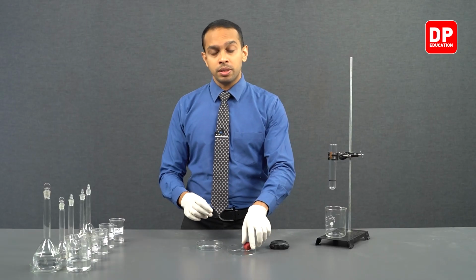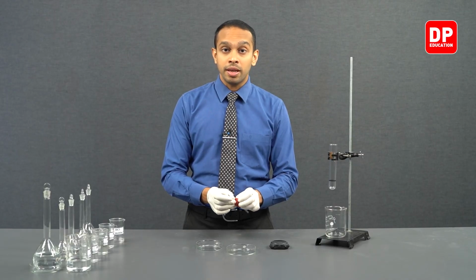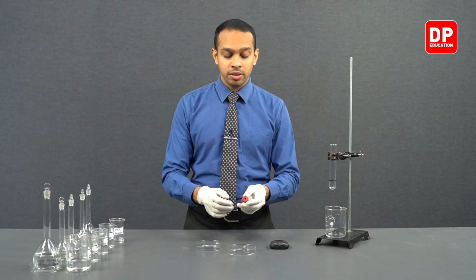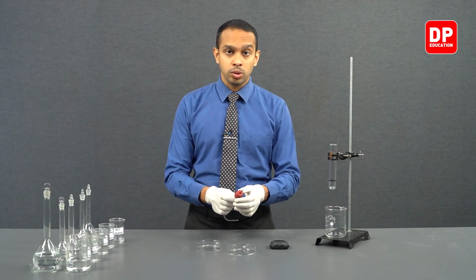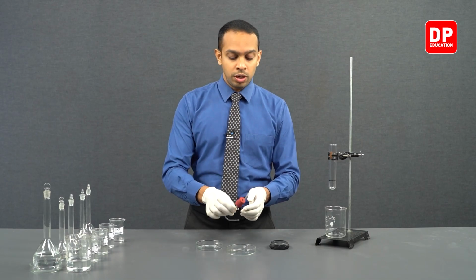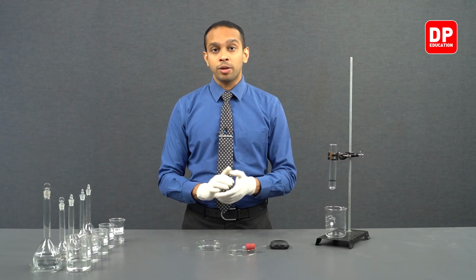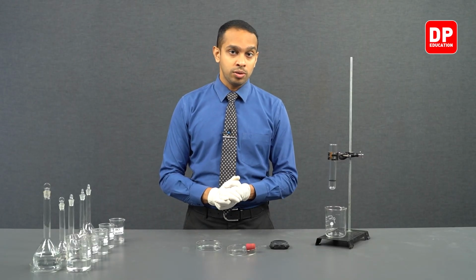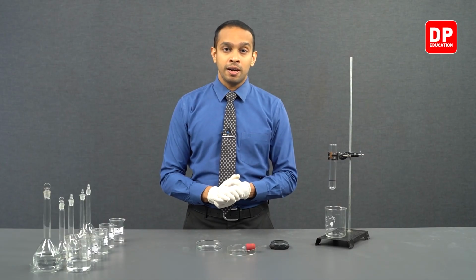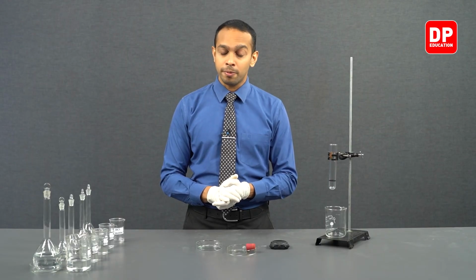All of these magnesium pieces are going to be equal in length, so that we keep the surface area that is exposed to hydrochloric acid constant. So we have measured each magnesium piece in such a way that each of them has a similar length.